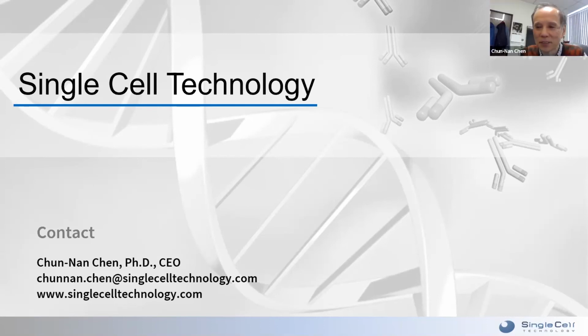Right. So Don Gwynn has another really good question. Her third question is, can this capture cytokines that plasma cells release? Yes, we actually looked at T cells. We haven't gone full force looking at that, but we do have a longer term project to look at cytokine secretion profile, because if you want to characterize different T cells, you want to look at the different subsets of it.